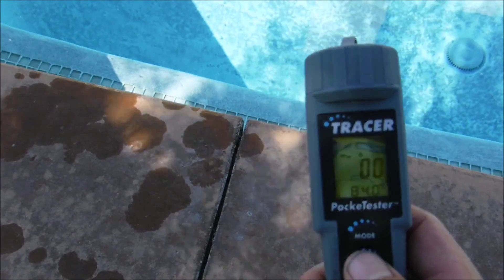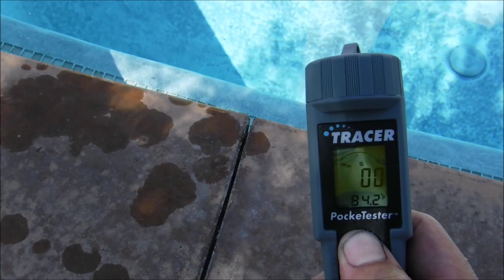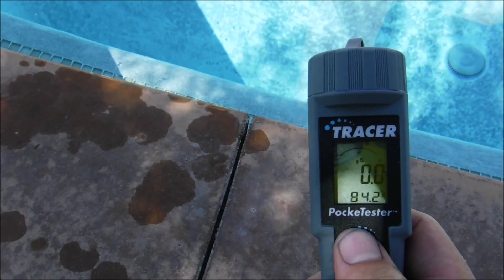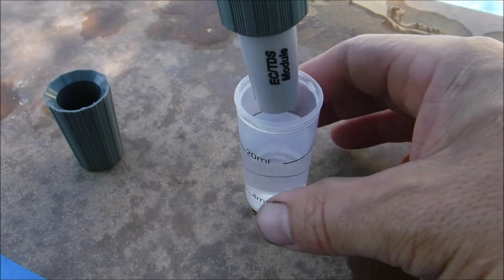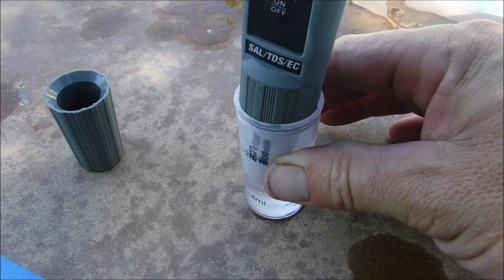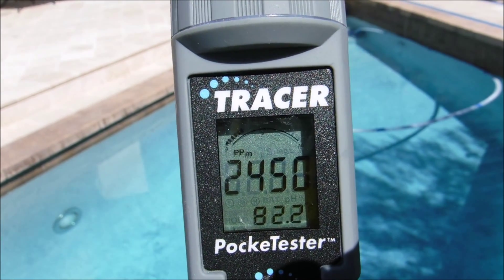At this point I'm going to go ahead and do the total dissolved solids, so I'm going to hold down the mode button. Right now it's in salinity with an S on the screen — now it's in conductivity — hold one more time, now it's in total dissolved solids. You're going to set the Tracer into the sample solution and give it a twirl to get any air bubbles out. This pool is reading total dissolved solids of 2,450 ppm.